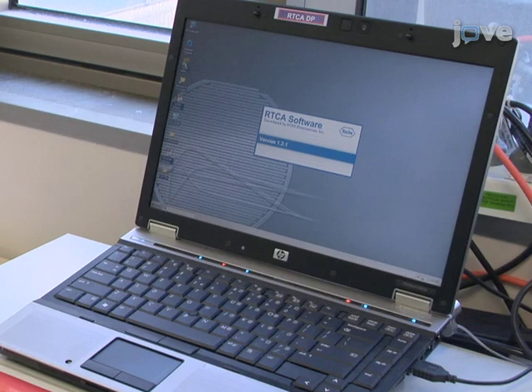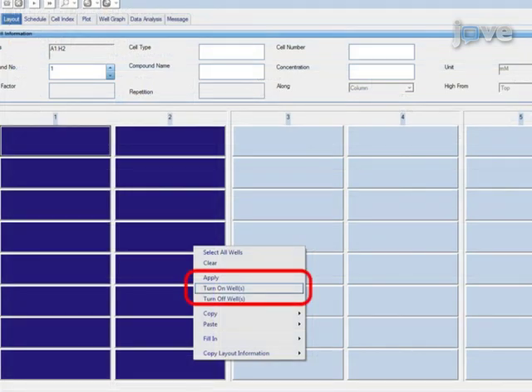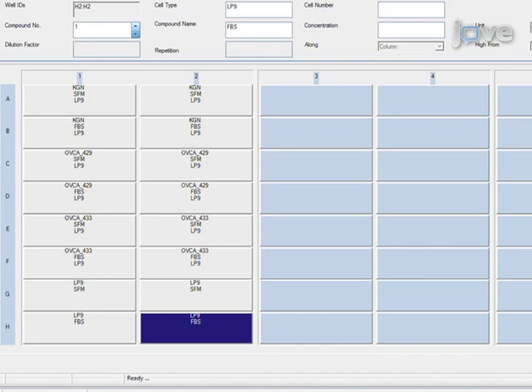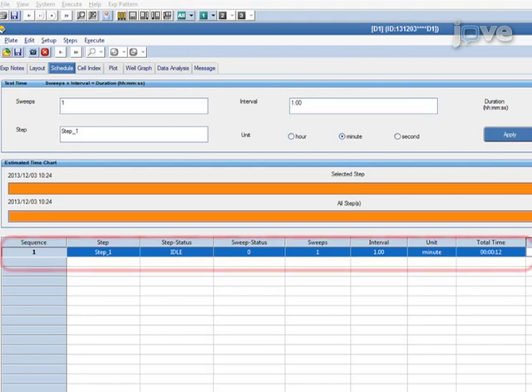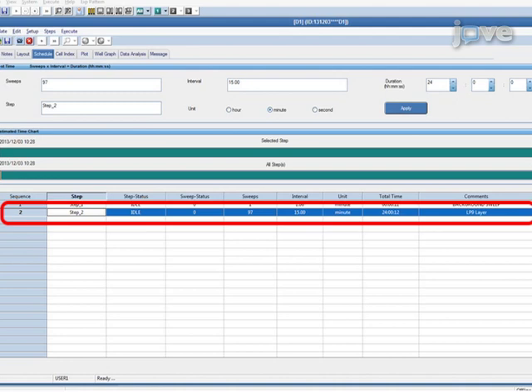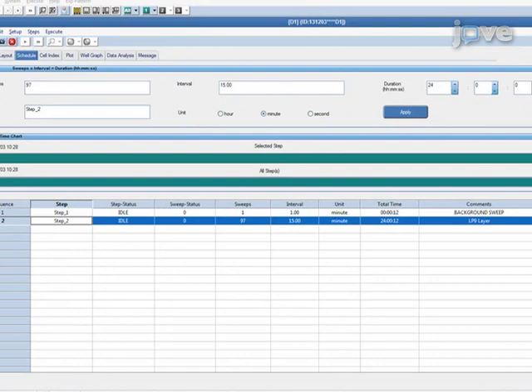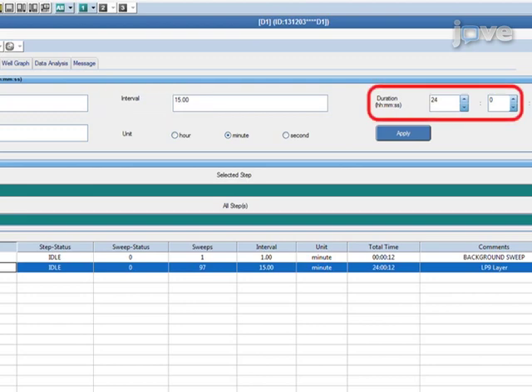Open the RTCA program and select the Layout tab. Highlight all experimental wells, right-click on wells, and select Turn On Wells, then fill in experimental conditions and cell names as desired. To add steps or sub-steps to the program, select the Schedule tab and right-click to add a step. The first step is a pre-programmed background sweep automatically incorporated into the program. Enter the desired program details for step 2 of the RTCA program, which will record readings during establishment of the LP9 human mesothelial cell monolayer. Add 15-minute time intervals between impedance readings and enter a duration of 12 to 24 hours.